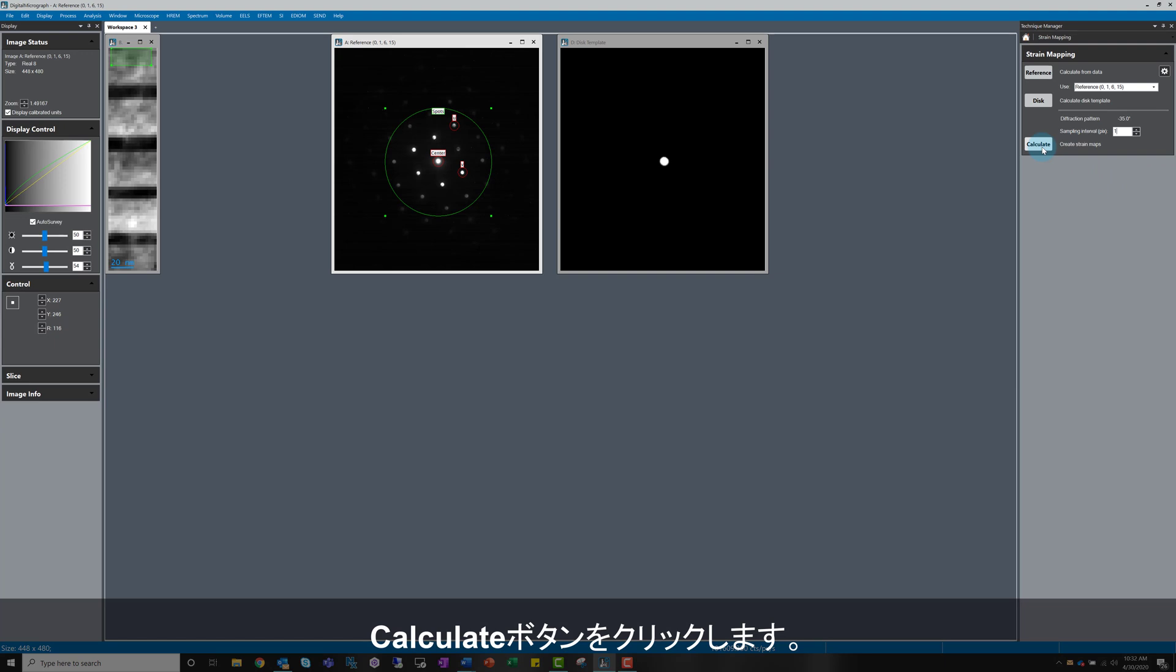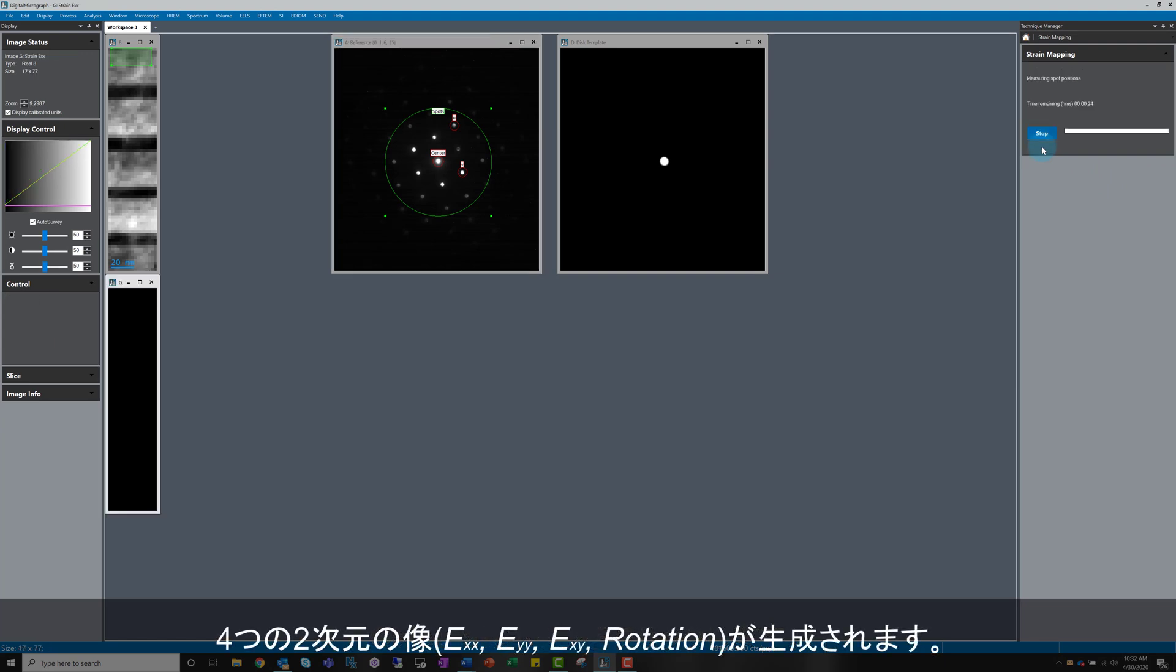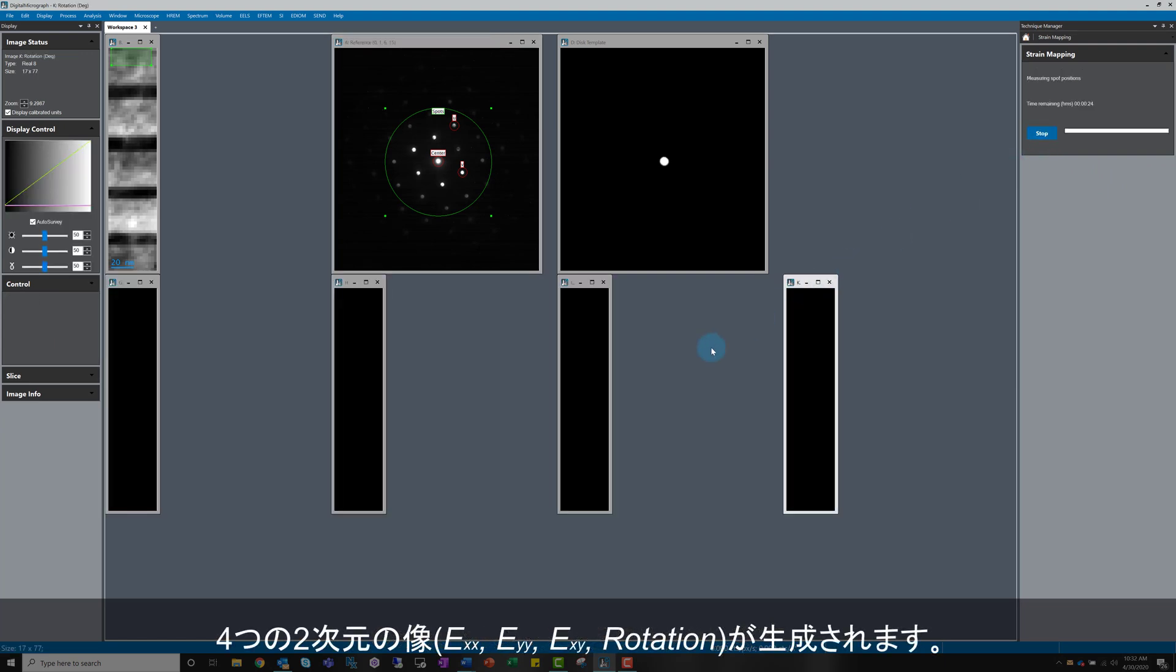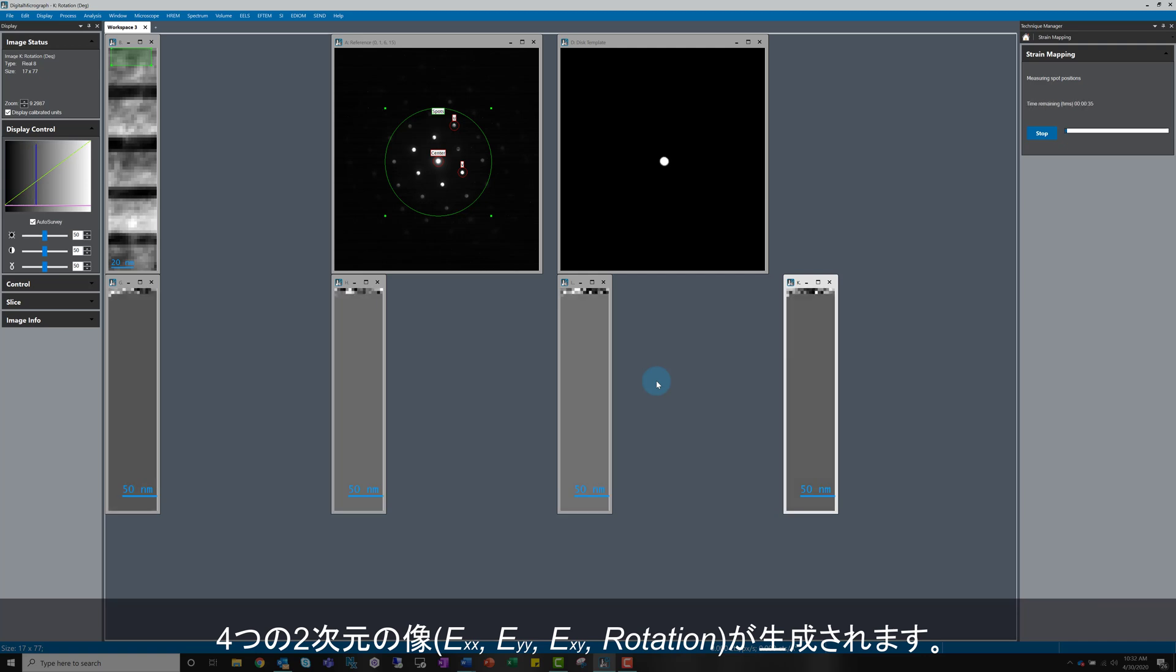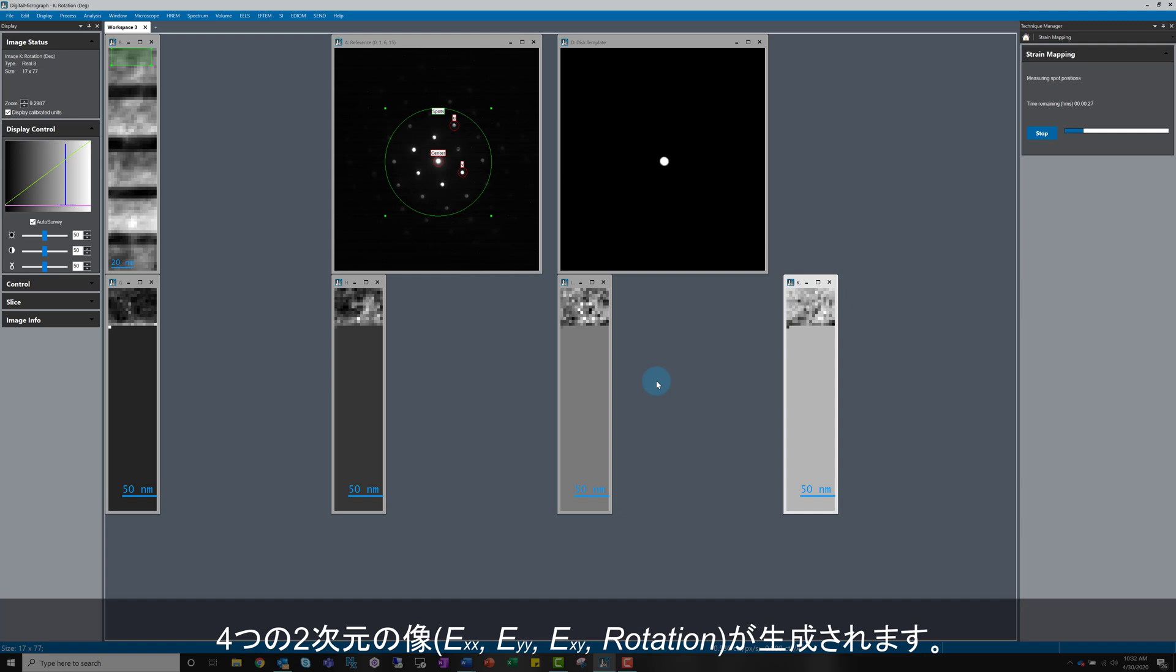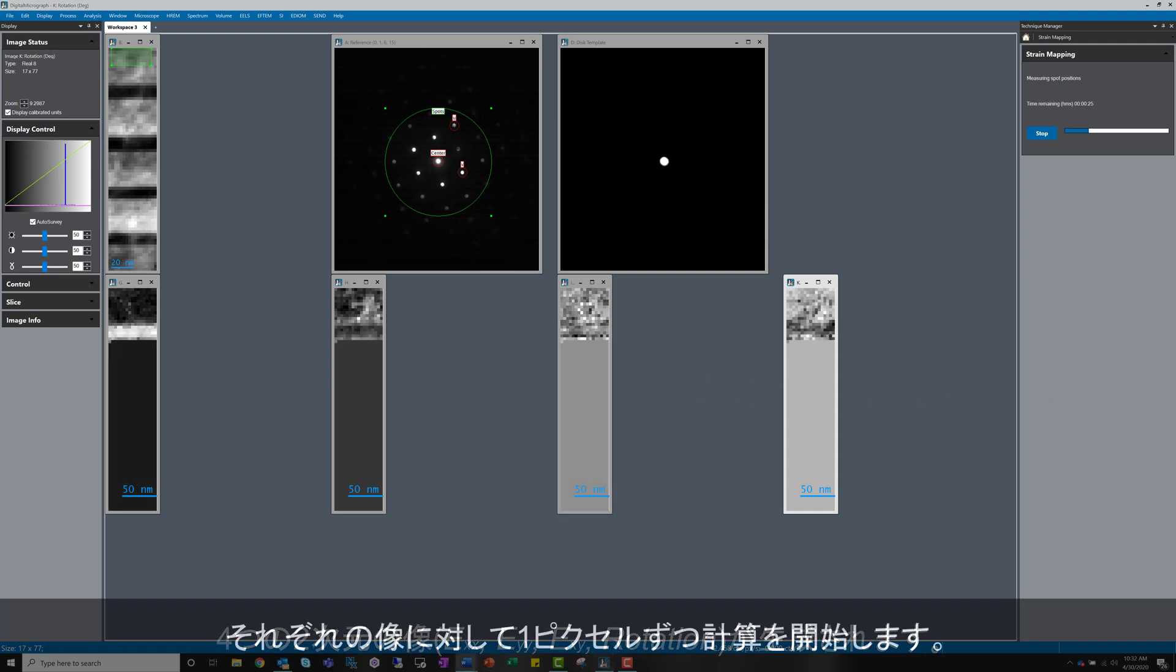The software immediately generates 4 two-dimensional images labelled EXX, EYY, EXY and Rotation and then starts populating these images pixel by pixel.